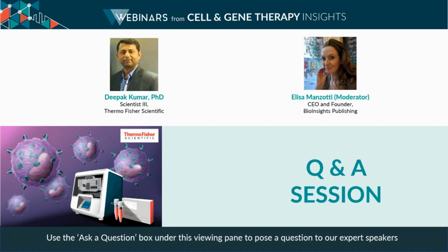Okay, and another question for you. What other cell types have you shown to be successfully edited using the Xenon? Oh, that's great. Internally, we have tested many cell types: activated T cells, resting T cells, iPSC, HSC. In this webinar, we presented NK cells. Then we have tested monocytes, Jurkat, so many like this. Wow. This has been tested, yeah.